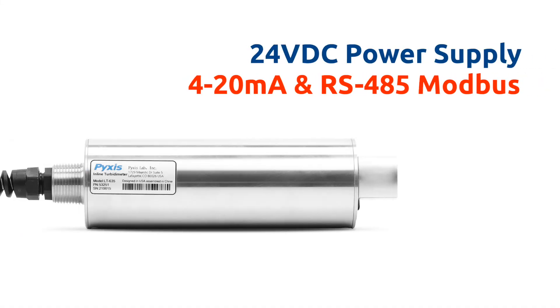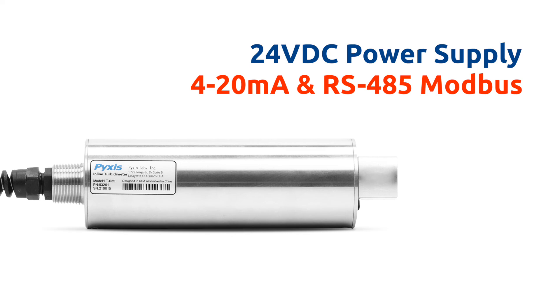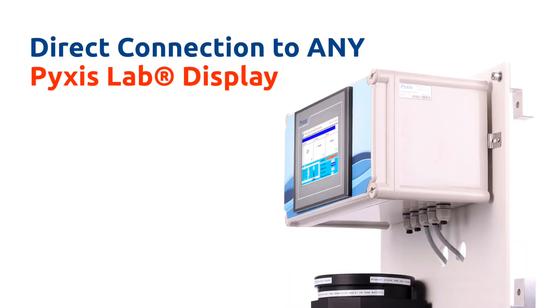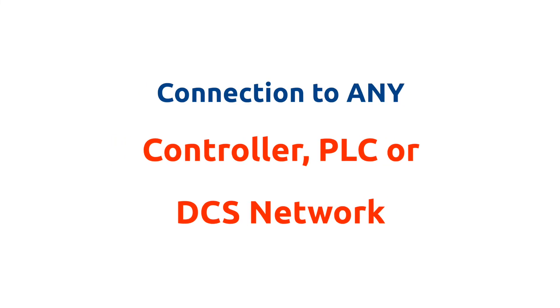The LT635 can be powered via 24 VDC power supply and offers fully integrated 4 to 20 milliamp and RS485 Modbus output signals. This allows connection to any Pixis display, data logging terminal or any OEM controller, PLC or DCS network.